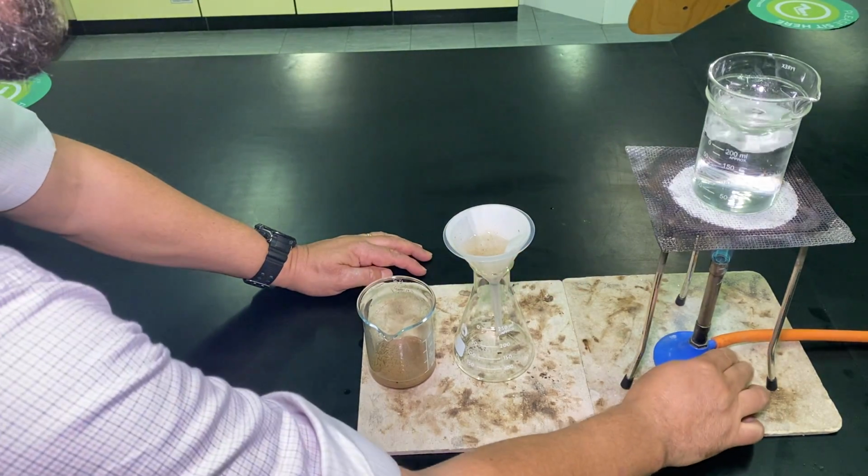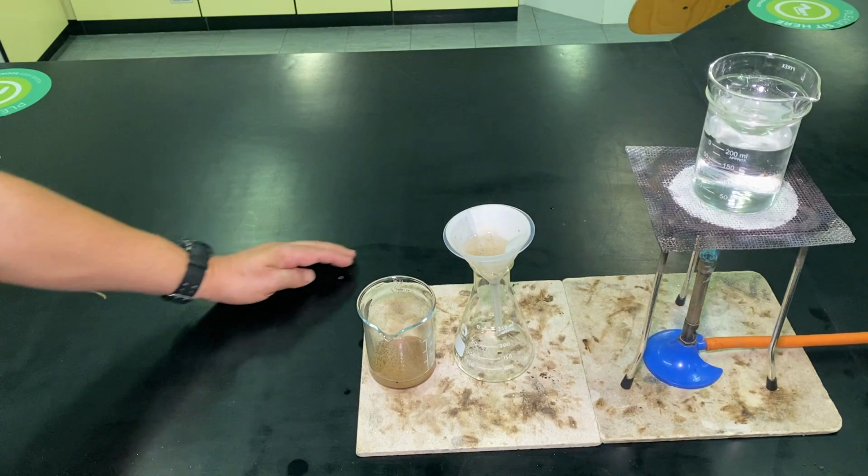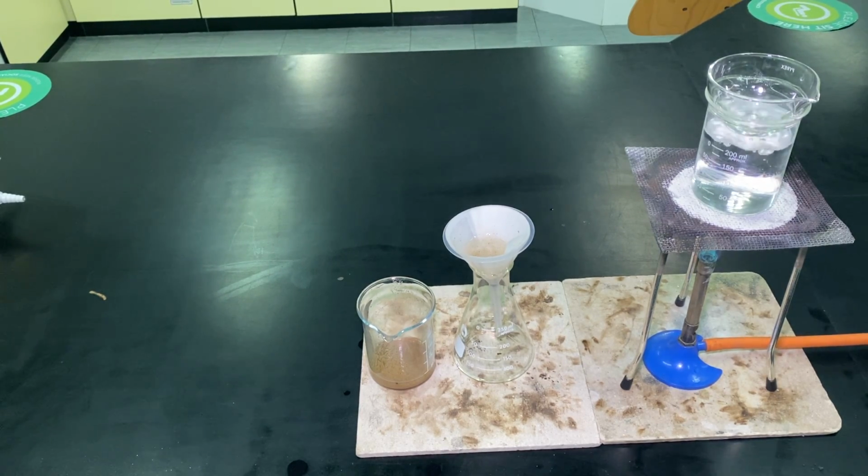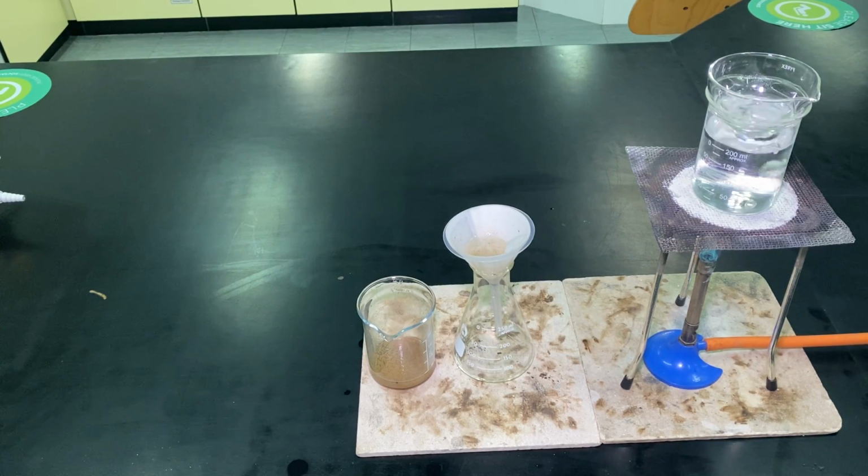Evaporating the water will separate the water from the soluble sodium chloride. Because when we heat the sodium chloride solution, the salt does not evaporate. Sodium chloride evaporates at a much higher temperature.